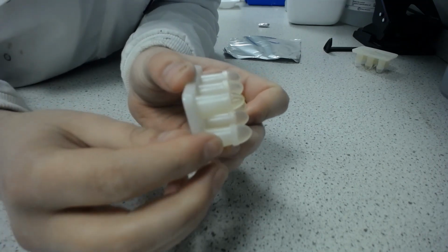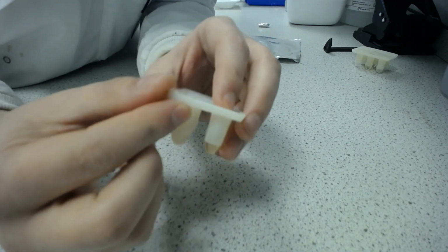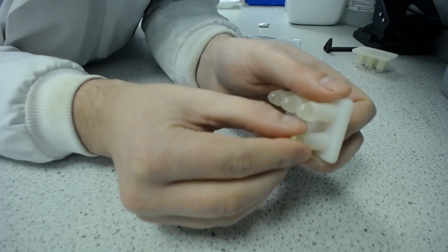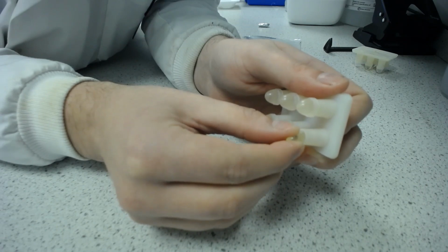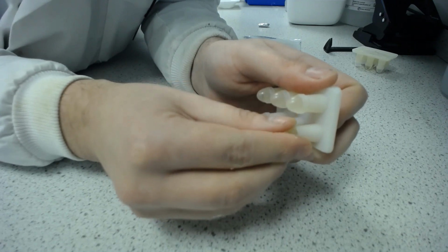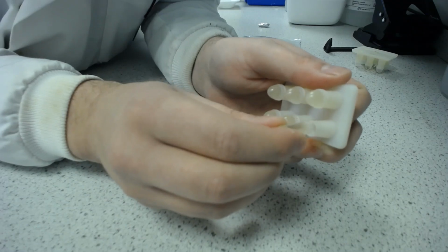Now what I'm going to do is push that from the back just slightly, just to get it going, and at the same time I will gently wiggle and ease the suppository out, and this is where it's going to break and I'm going to look a fool. Hopefully it won't. You can see they take a bit of persuasion to come out, and there you go.